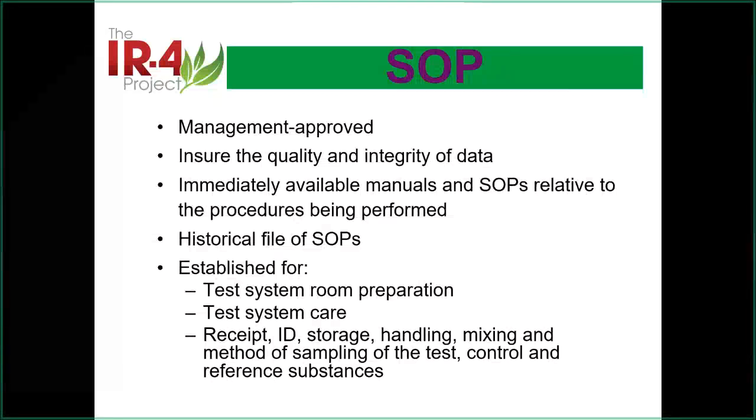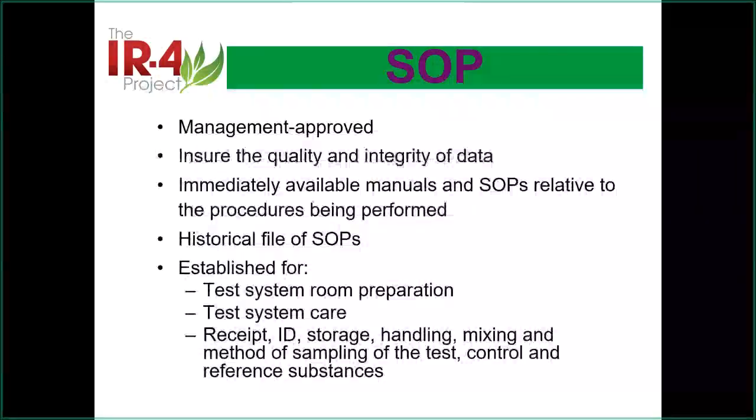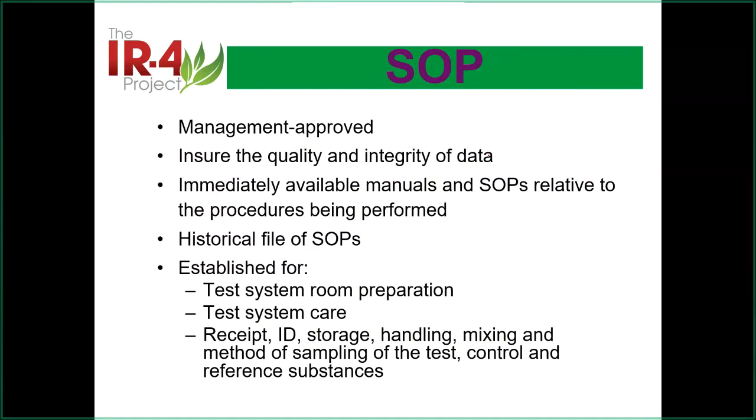This is overall in your lab. It doesn't matter if you do the ISO work or GLP work. Sometimes you don't do any of these work, you still have an SOP there. Okay, so that's how you do your work. That's the documentation. So in a GLP study, the most important thing you're going to have to show is on the screen. You need to get the management approval here on the SOP.